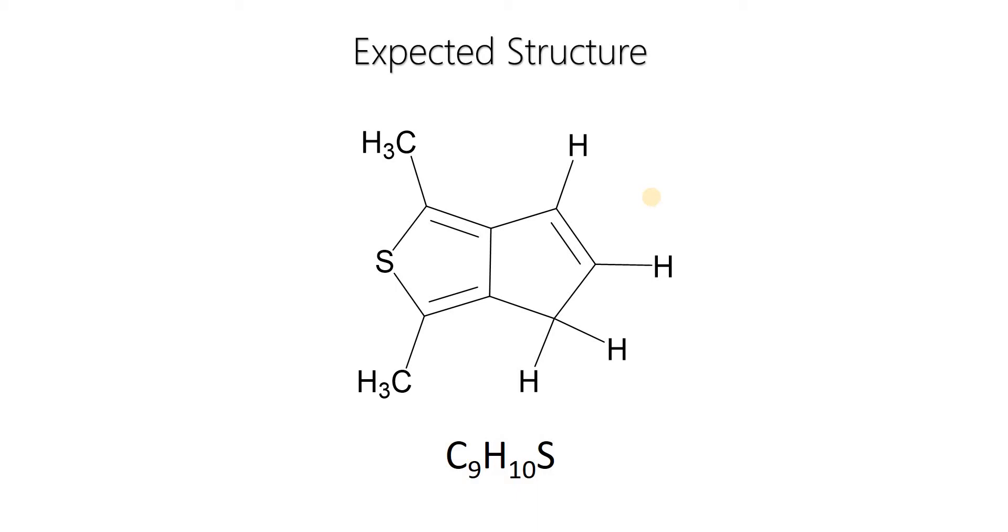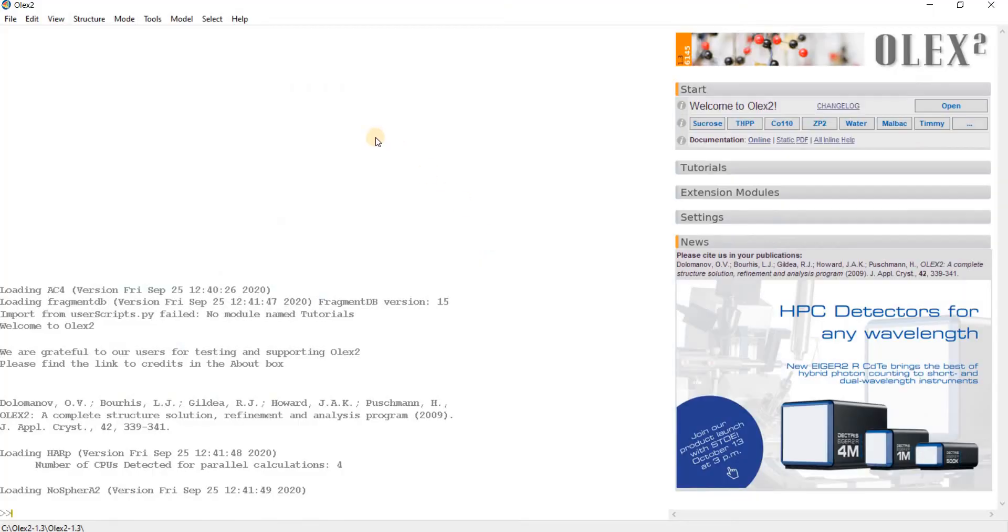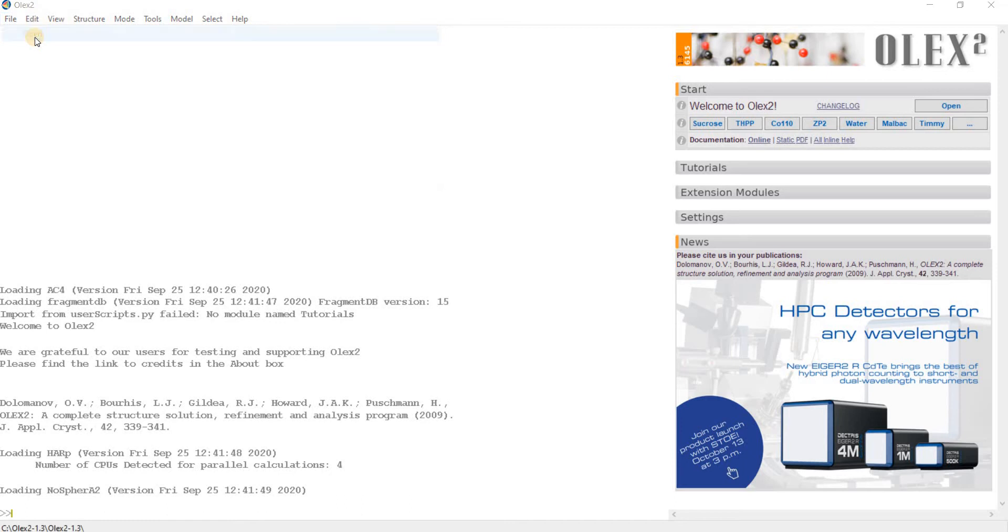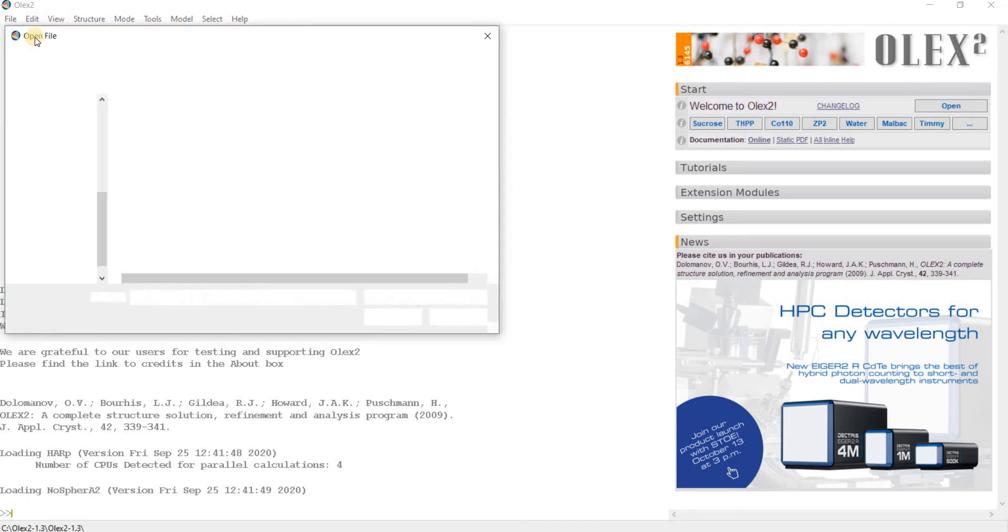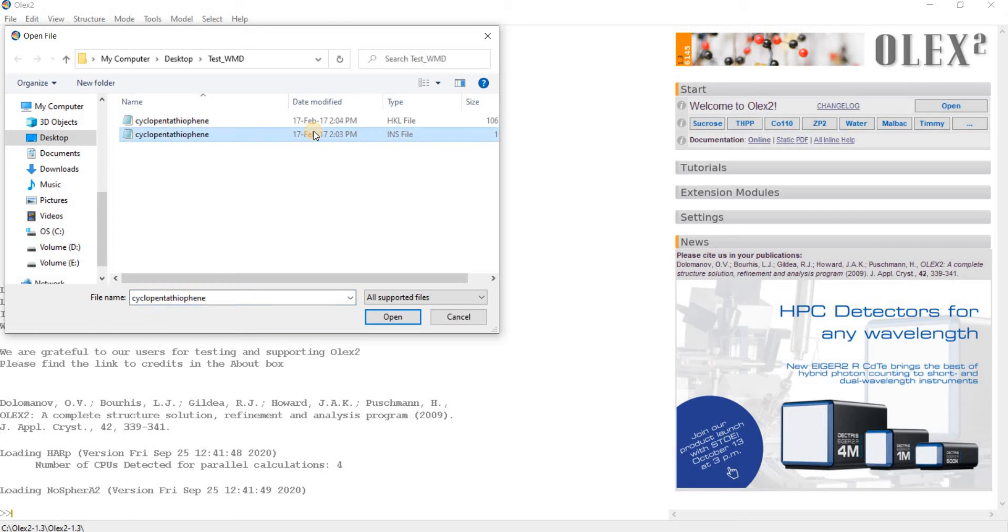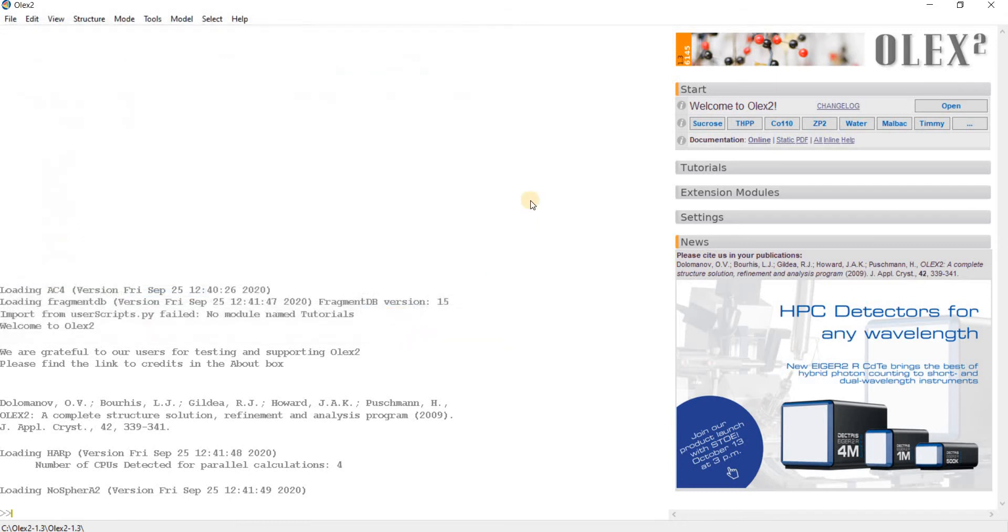The molecule is small and we are expecting a very straightforward refinement. Let's start the refinement. First, open the program Olex2, then go to file, open. There is a folder or directory named SWMD on the desktop with two files: the INS file instruction file and the HKL file reflection file.